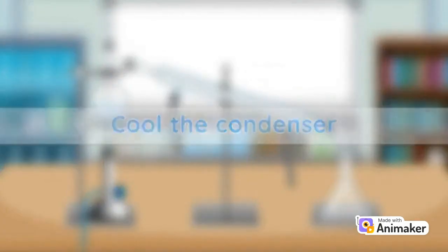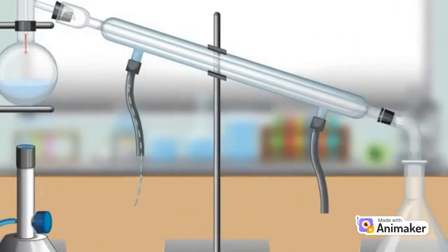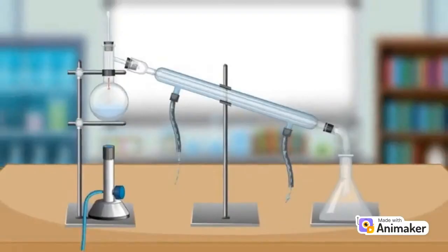Step 2. Cool the condenser. Cool water is pumped into and out of the condenser to keep it at a low temperature. This is essential for condensing the vapor back into liquid.